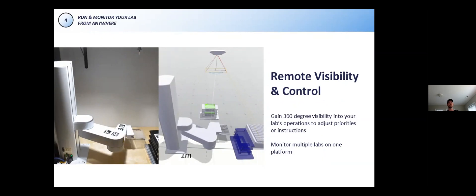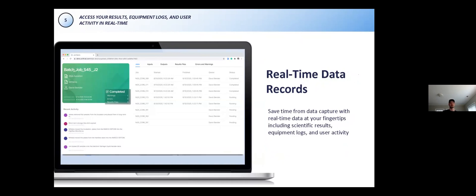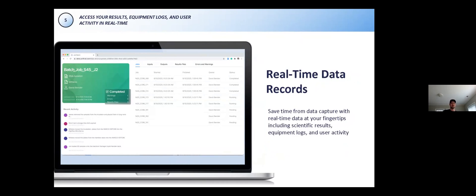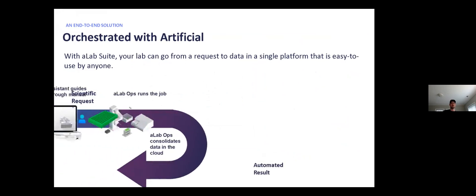After the process is complete, you can view a results record of everything that happened. In this results record, you can see all of the requests that were batched together, all the inputs and outputs, the lot numbers of reagents, and any errors or warnings that may have come from the automation system. In this example, on the bottom left, you can see all of the stream of events that were related to this particular batch. On top there, the plates were moved out of the incubator and into long-term storage, and we have associated with that a timestamp and the person who performed the actual action.